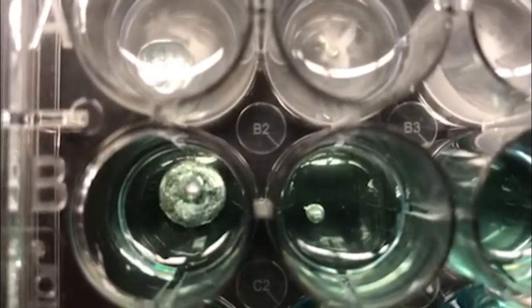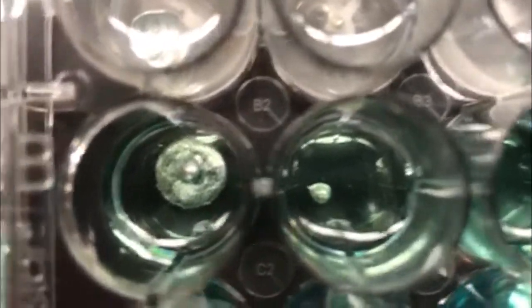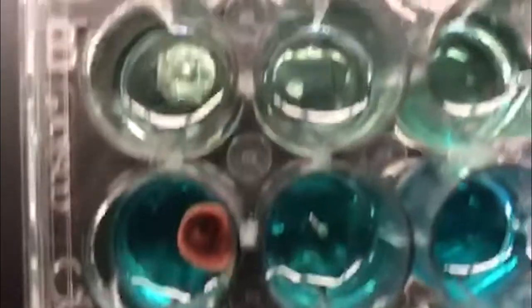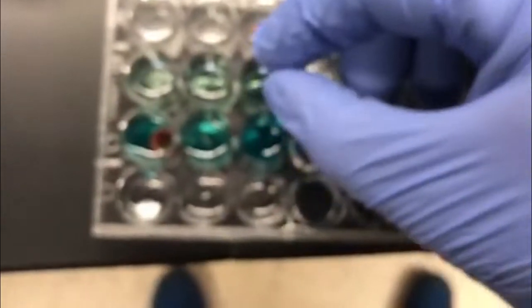Okay, now A. It looks like A might be reacting in that nickel solution. See those little black specks there? That might be something kind of materializing. Oh, wow. Okay. Now we've got our 4th metal into each of our solutions.